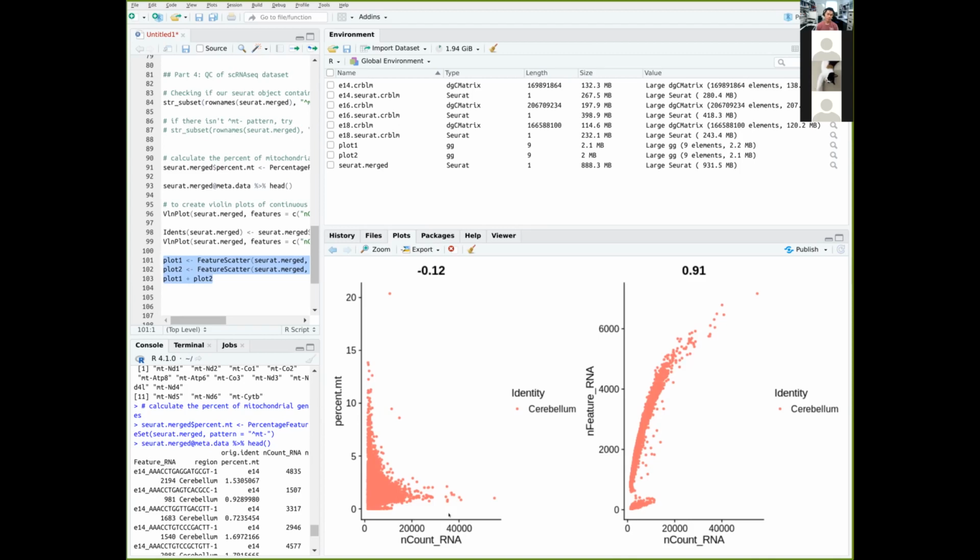not too negative, but slightly negative value, which basically means that cells which has very low RNA count represent non-viable cells, and they should have higher %MT metric. So it should be high on the top left-hand quadrant, and it should be low in the bottom right quadrant. So the slope will be slightly negative. So currently the data is actually good as it is, because it's a negative value, and you see a good correlation of number of RNAs and %MT.